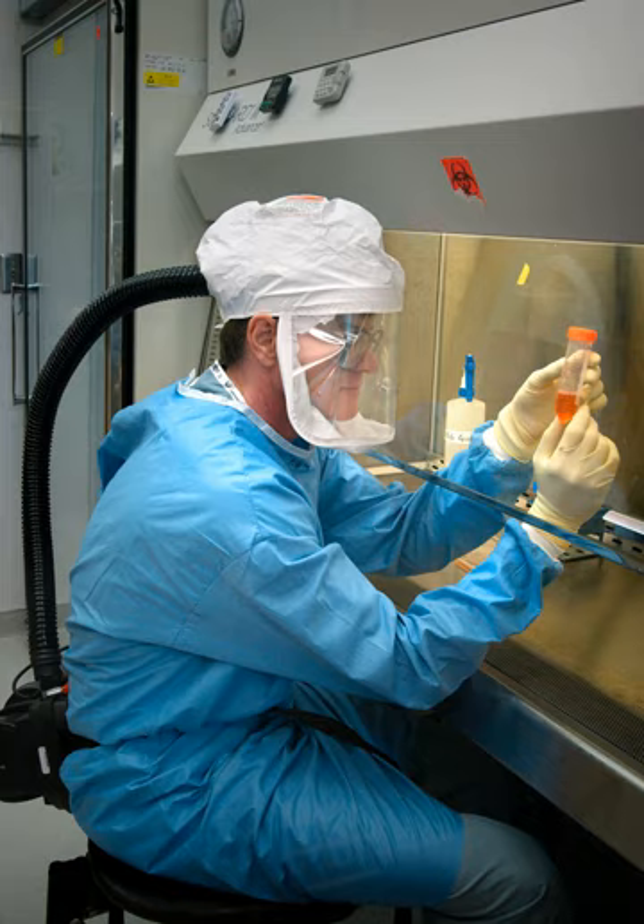Once work inside a BSC has been completed, it is necessary to decontaminate the surfaces of the BSC as with other lab equipment and materials. When a BSC is serviced or relocated, including replacement of HEPA filters, it must be gas decontaminated. Gas decontamination involves filling the BSC with a poisonous gas, most commonly formaldehyde gas.